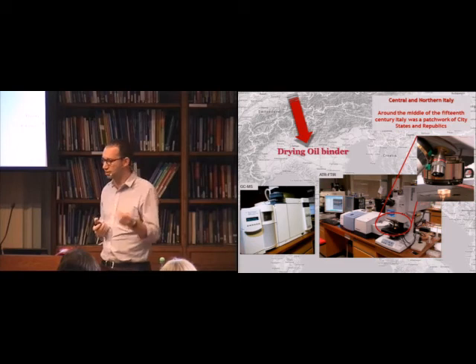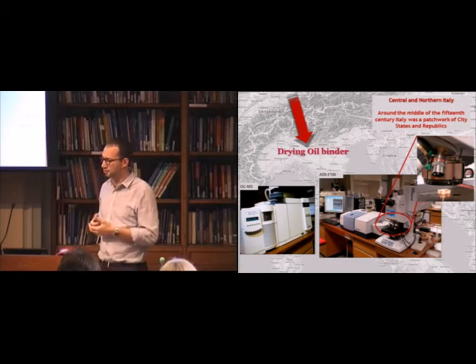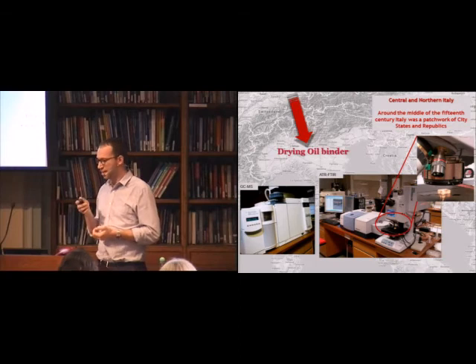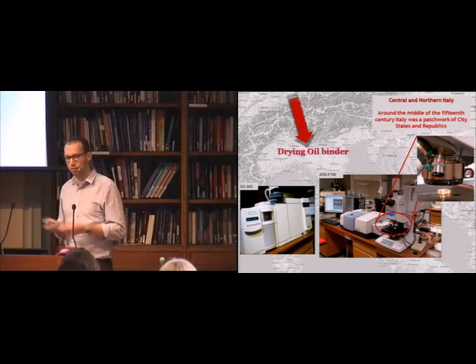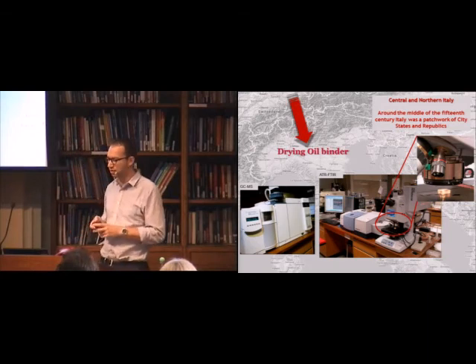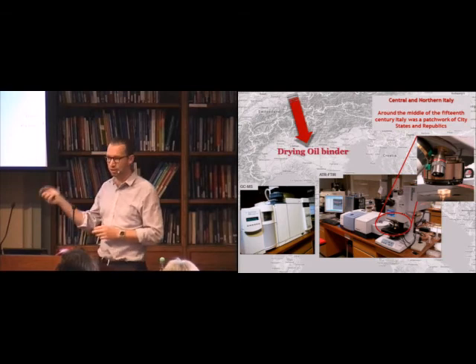The question that I'm asking, as a chemist like myself, is: can I tell the difference between egg, so protein, or oil? Any chemist worth their salt should look at you and go, of course I can. It's a very easy thing to do. And then if I say, well, okay, what if my sample is less than half a millimetre in size? Then you go, well, that's small, but it's not as small as these bits of kit. They're used to dealing with really small samples.